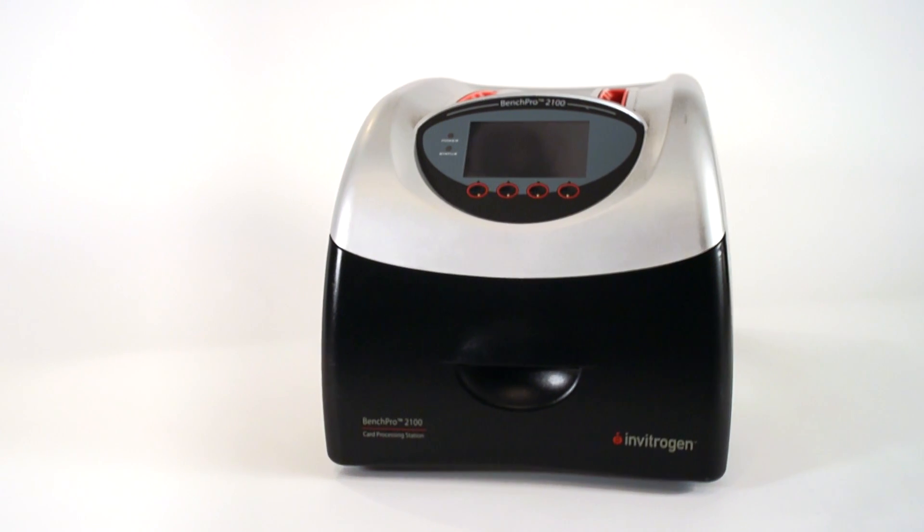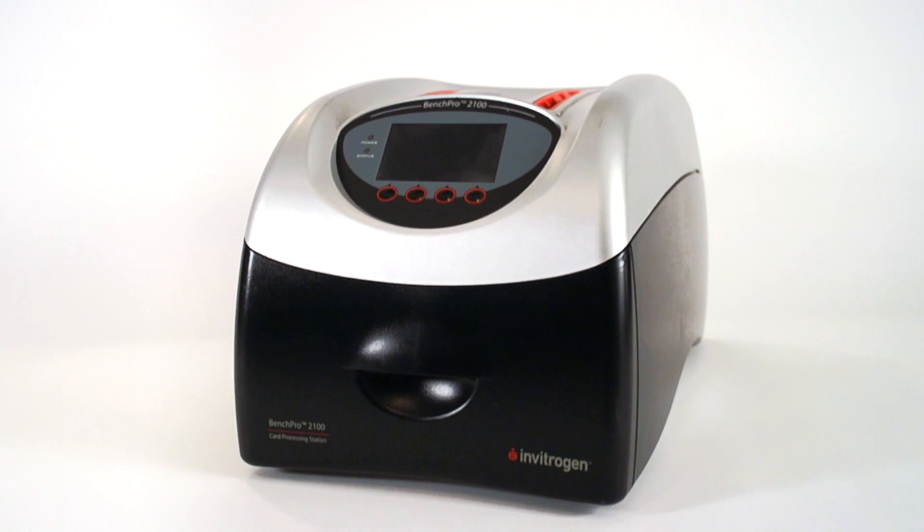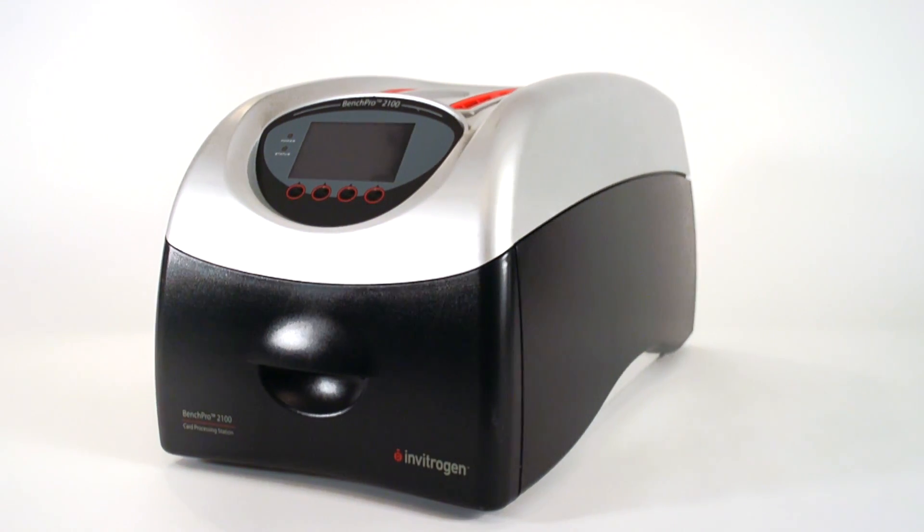The system is very easy to use and has improved and streamlined our processes a lot. We have to screen a large number of samples — on a busy day that means 20 or 30. With the BenchPro machine we can easily process 30 to 50 samples without getting to the stage where you get tired or bored and start making mistakes. It really takes away the human error aspects for us.